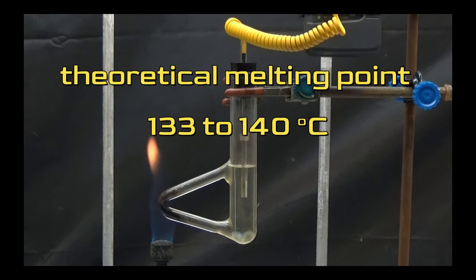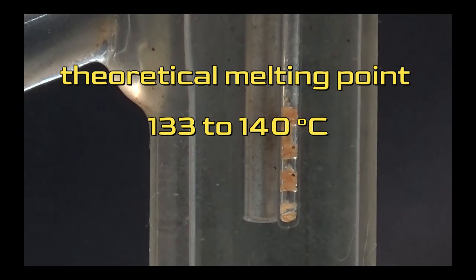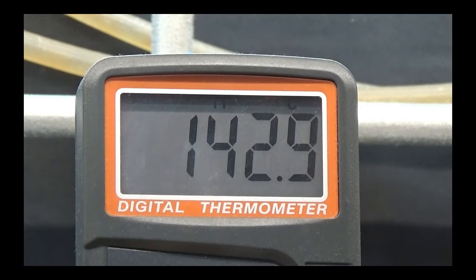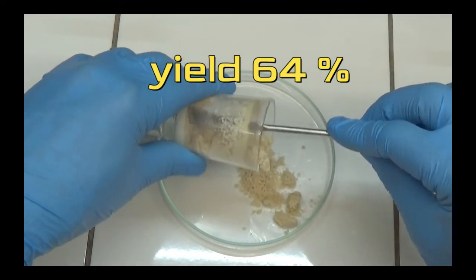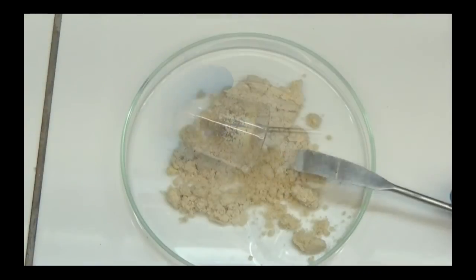The theoretical melting point of 2-benzoxazolinone is 133 to 140 degrees, and in our test, it was 143 degrees, quite close to the theoretical point. The yield of 2-benzoxazolinone synthesis was 64% when salicylamide was used.